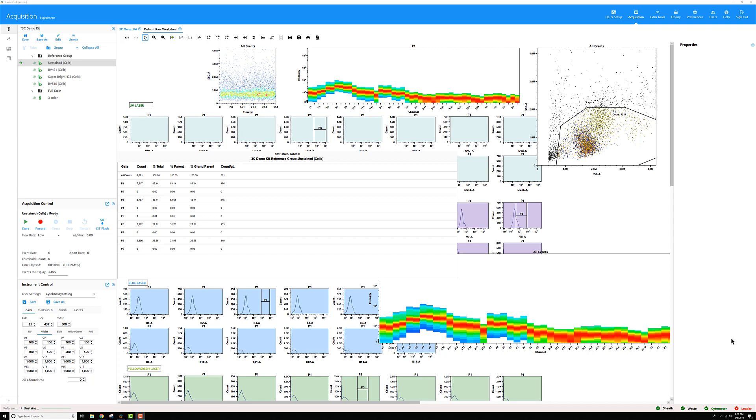If you ever opened an experiment and found your default raw worksheet has turned into something messy like this, this tutorial is definitely for you.